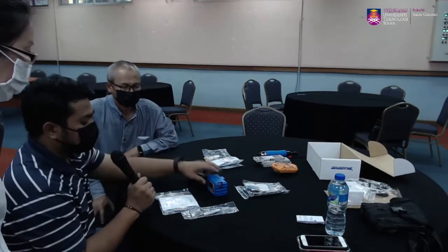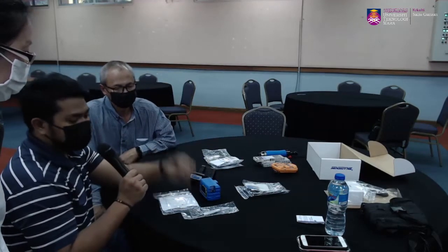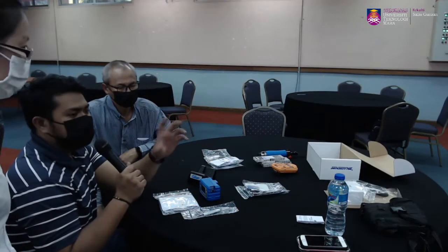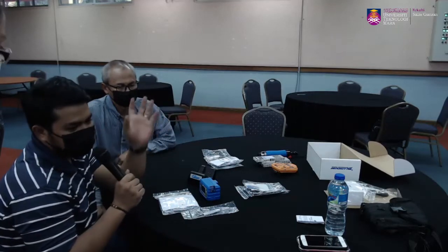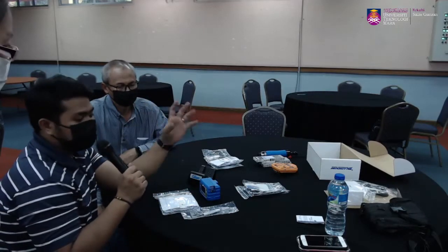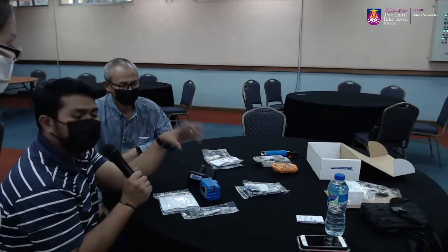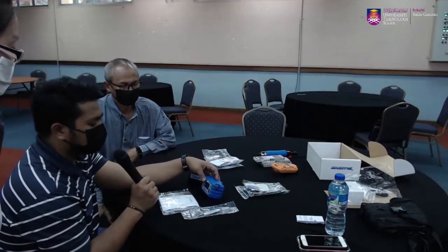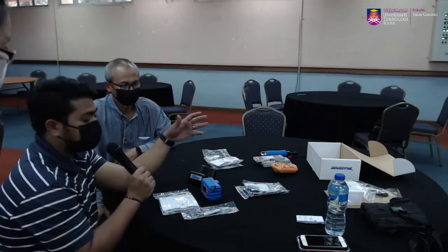So from there we set the flow rate, for example 1 liter per minute. We want to see, with the connected media, whether there is any variation in the flow rate. So from there, the analysis it does is in terms of initial and when we finish, so we want pre and post. We want to see whether the variation of our flow rate differs from the start to the end. Okay, so once the instrument arrives, we will go through how to calibrate using that airflow calibrator.